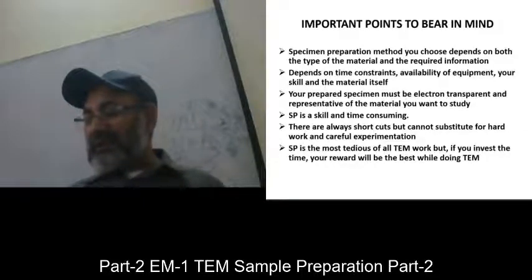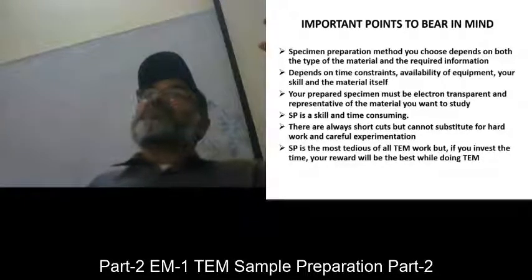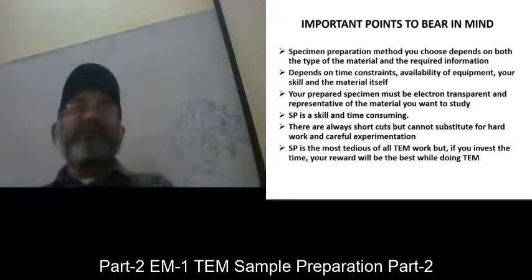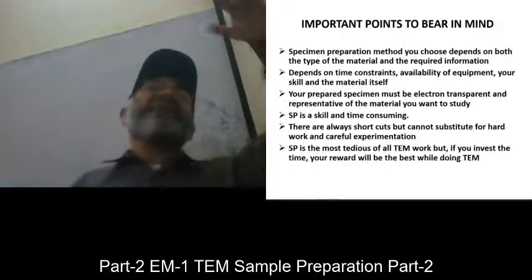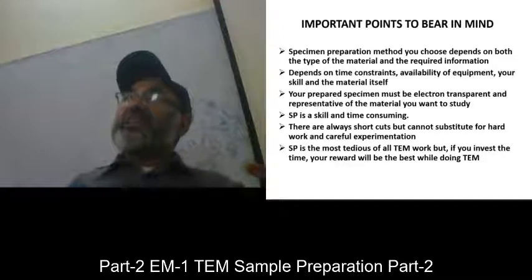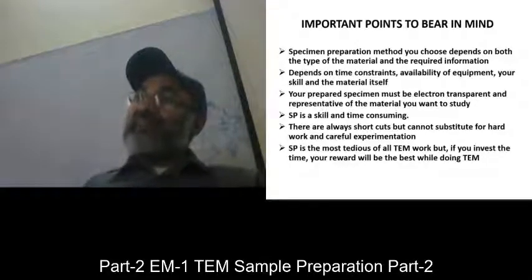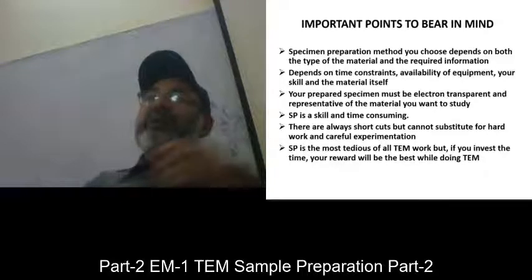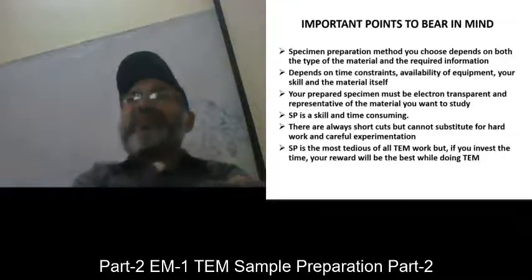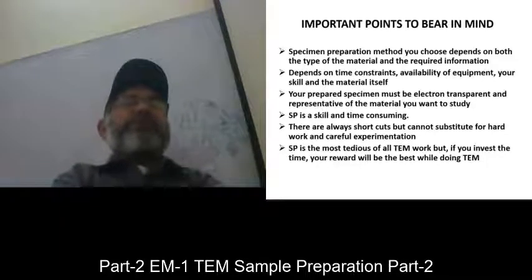Some ions are volatile, and on the surface, the composition will be different in comparison to the bulk, because in the bulk, the volatile ion cannot escape. So the surface composition is usually deficient in the volatile cation. For example, you have barium zinc tantalate. It is an oxide composition commonly used in electroceramics.